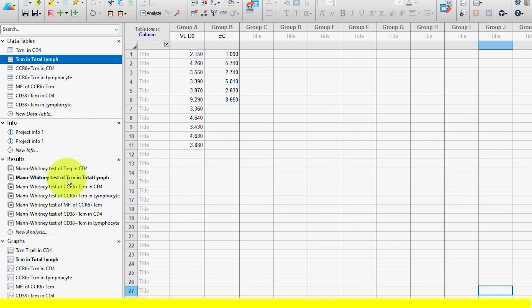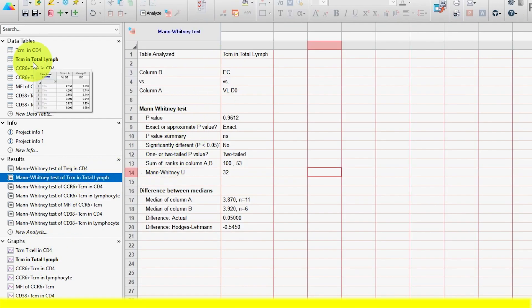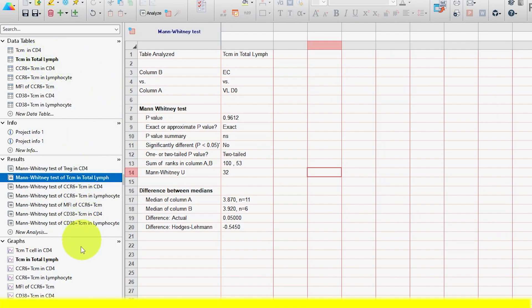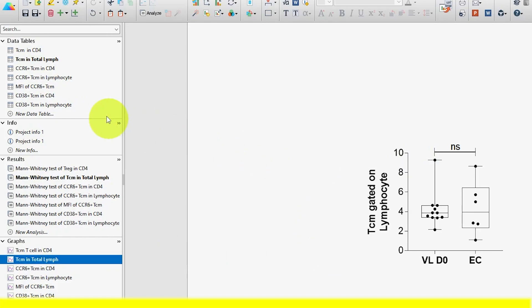If you click on the result section, you can see the result of this associated file. And also if you click on the graph file, you can see the graph. So this is very easy to find the associated result and graph if you have a limited number of files.